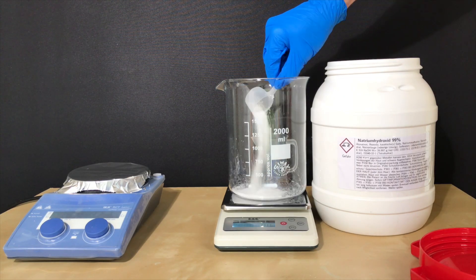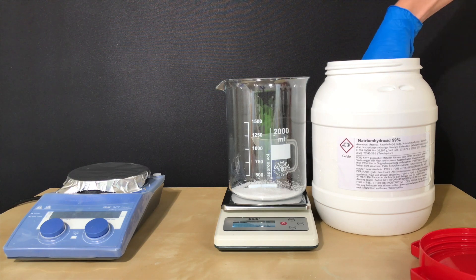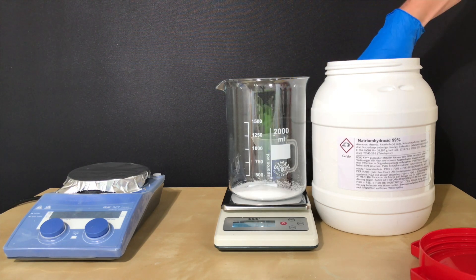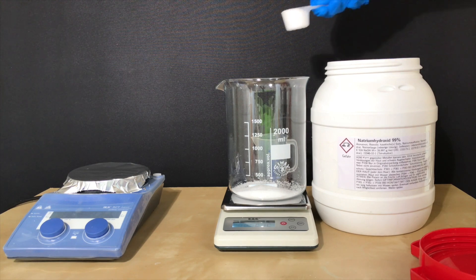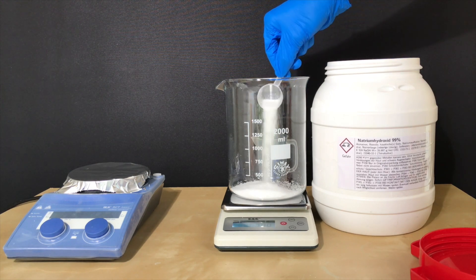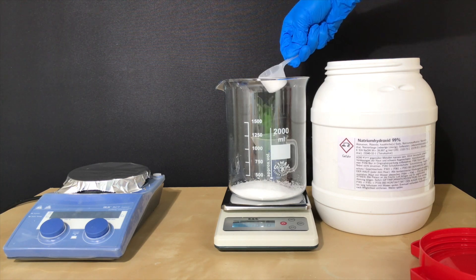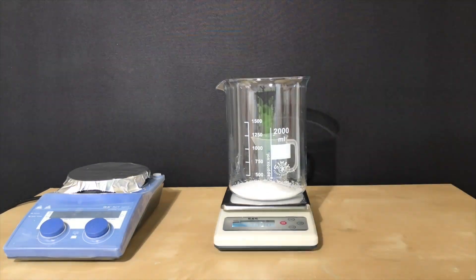A beaker was put on a scale, the scale was set to zero, and we are ready to begin. The sodium hydroxide was weighed out first. As you can see, sodium hydroxide is a white powder, but as it is caustic you should not touch it — I put on some gloves. A 2-liter beaker was used because it had the perfect size for today's preparation.